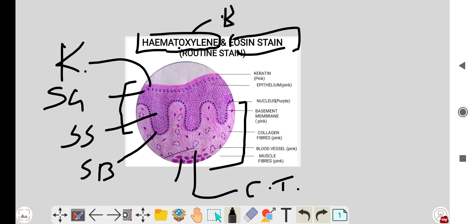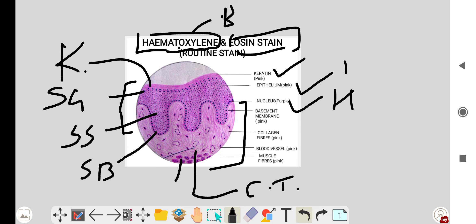Please remember: all nuclei of the epithelium and connective tissue stain with hematoxylin, which gives a purple or dark blue color. All other components of the epithelium and connective tissue stain with eosin. The keratin layer is pink in color, stained by eosin. Epithelium components are pink, nuclei are dark purple.